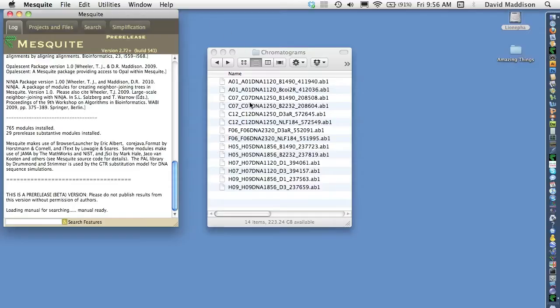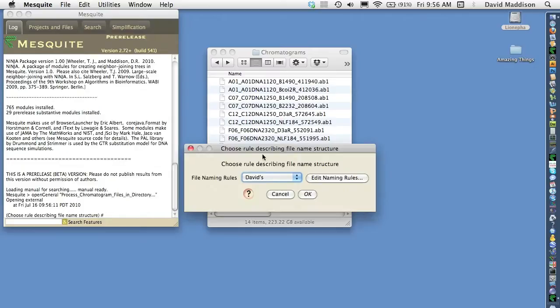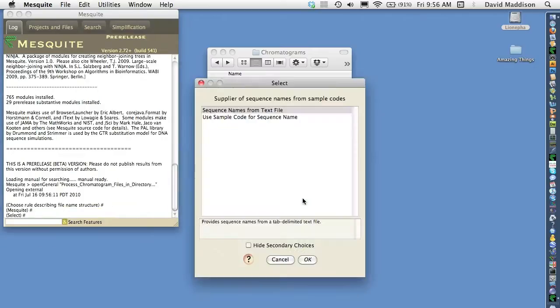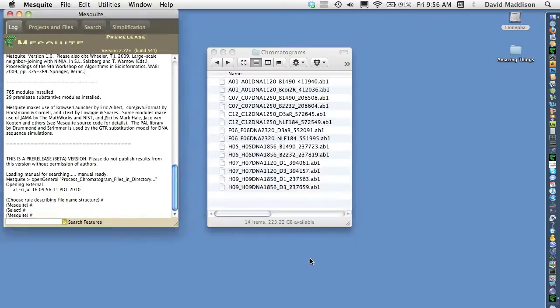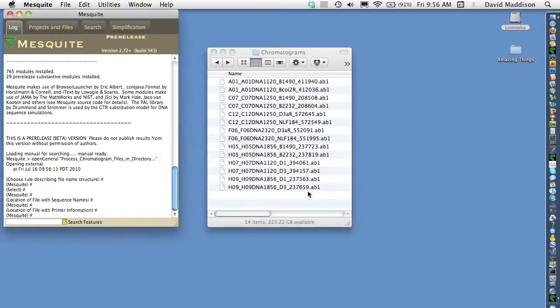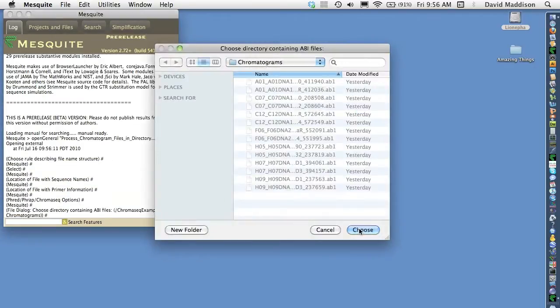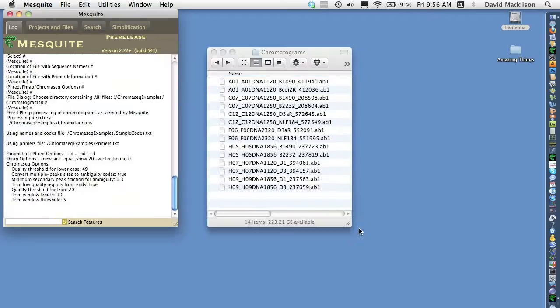Here we have a directory of chromatogram files which we're going to ask ChromaSeq to process. It's going to ask us a bunch of setup questions and we won't worry about details. Here's our directory.